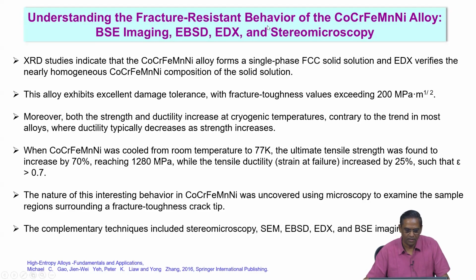understanding the fracture resistance behavior of cobalt, chromium, iron, manganese, nickel alloy. This is another high entropy alloy, using backscattered electron imaging and EBSD, EDX and stereo microscopy. So we will combine all these techniques to understand this fracture resistance behavior.